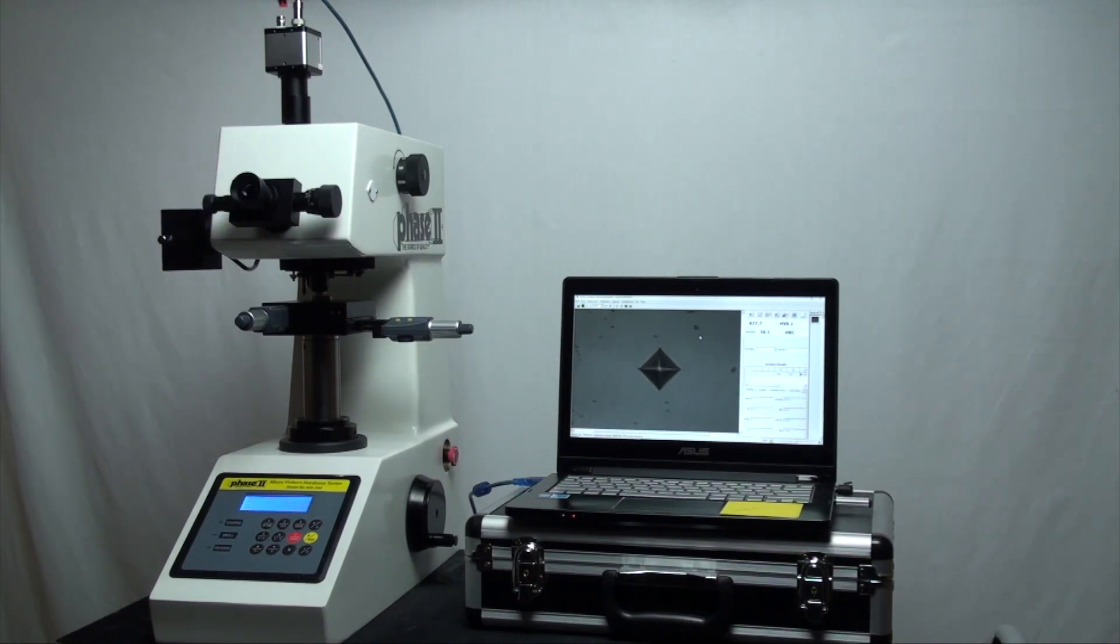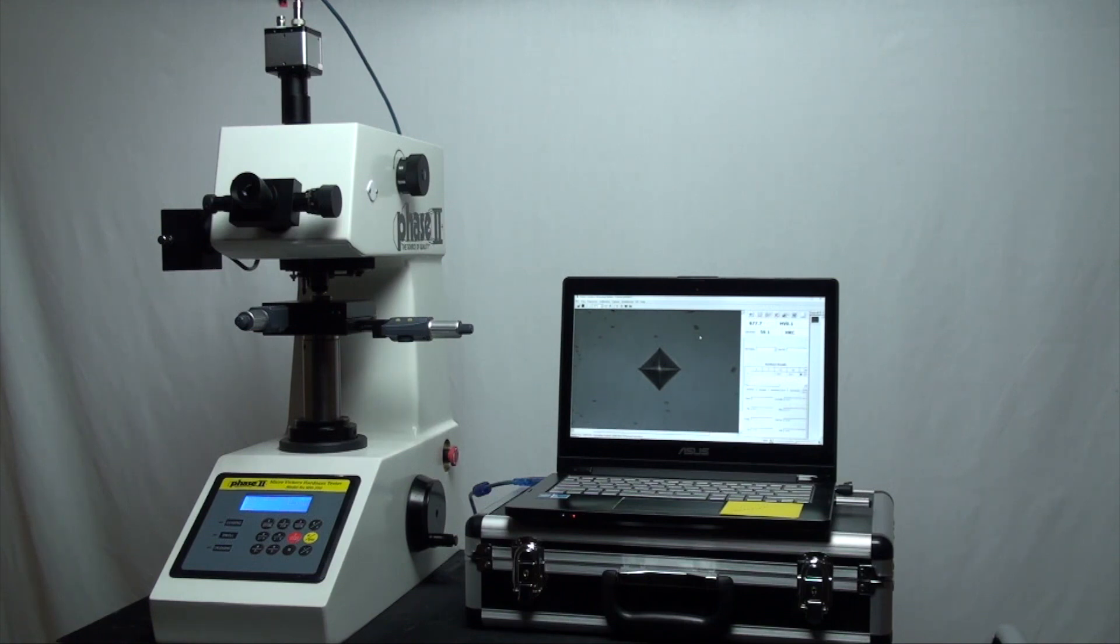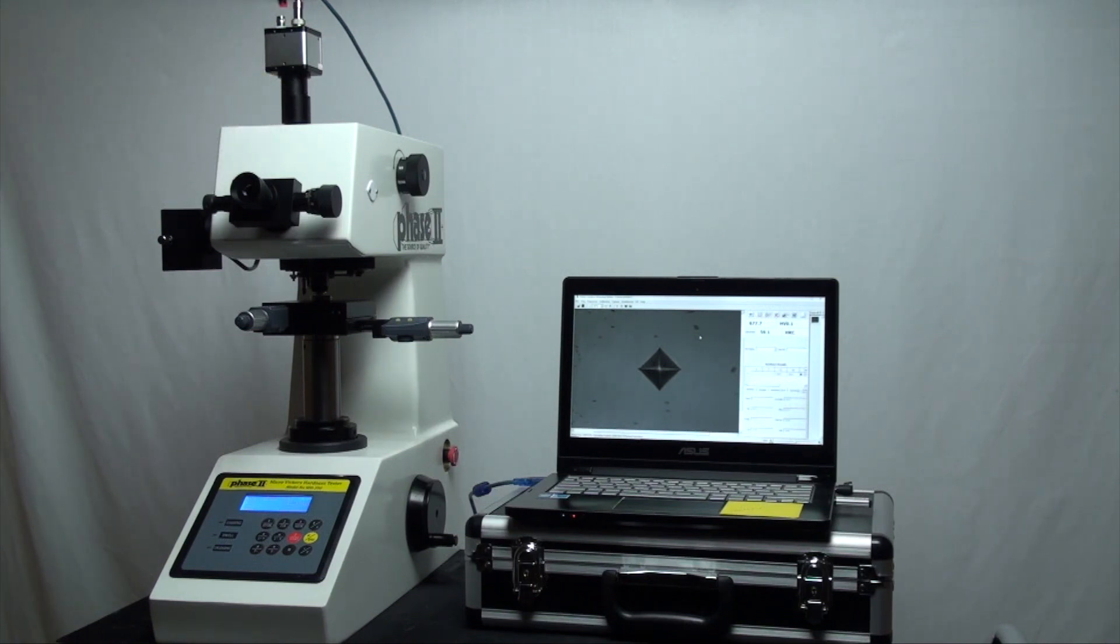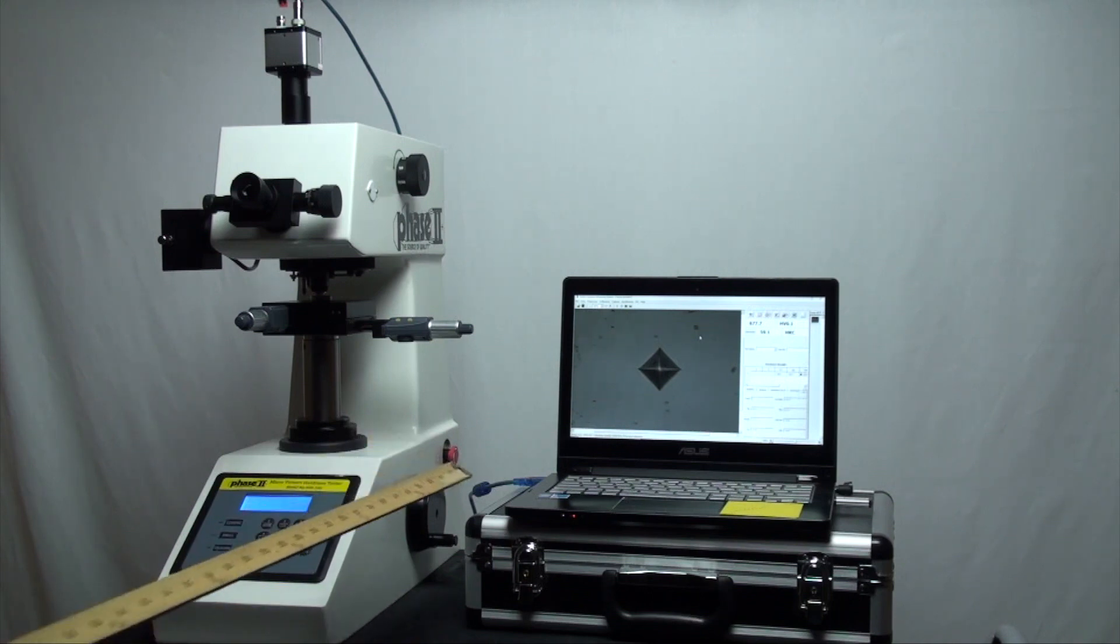For today's demonstration video we will use the digital optical system you see installed here on top and connected via USB cable to a laptop.